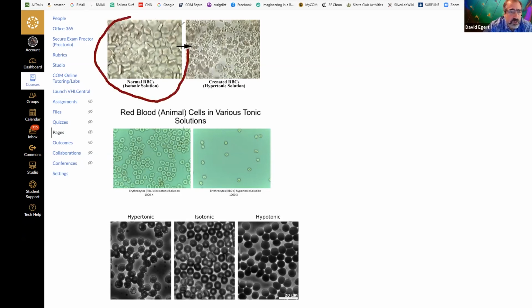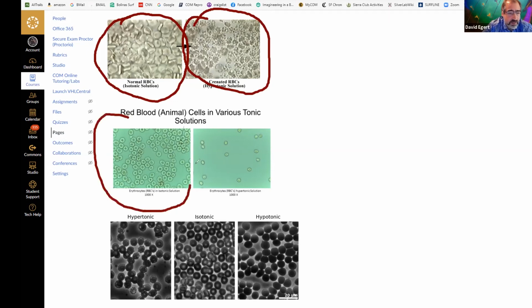But which of your test tubes is this most likely from? This is going to most likely be the 0.6 osmolar, whereas this is going to be 0.3 osmolar. This is kind of showing the same thing. The blood cells typically look like this because they're round with that kind of pucker. This is what a normal healthy blood cell looks like. But when they crenate, they turn into these little asterisks, or I was calling them pufferfish. They always get all spiky looking with all the cytoskeletal elements starting to jab out.